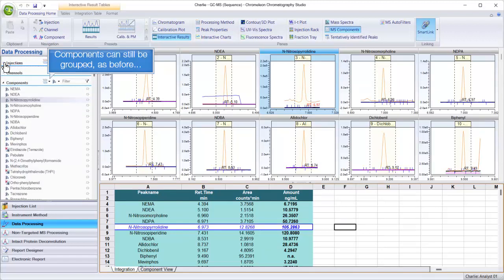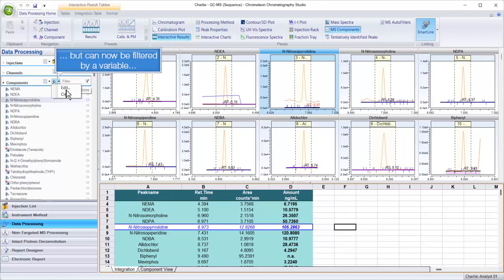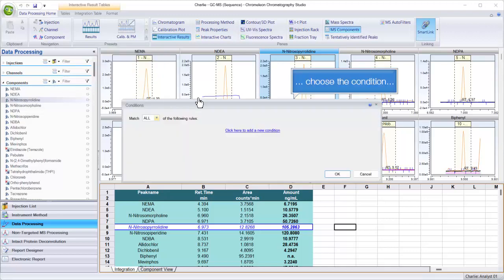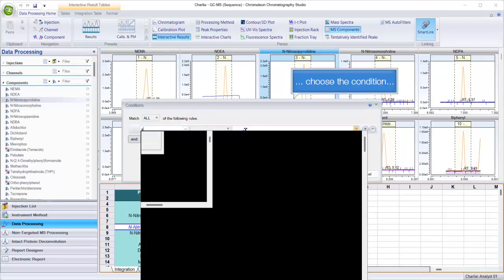Components can still be grouped, as before, but can now be filtered by a variable. Choose the condition.